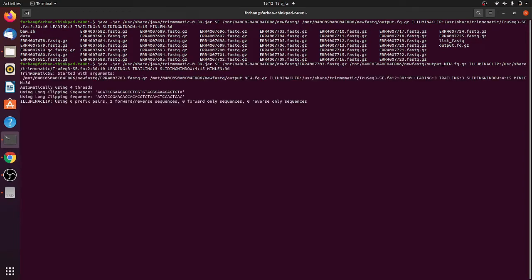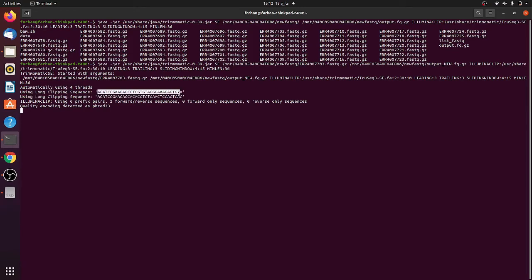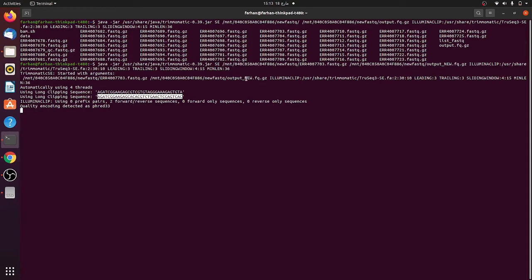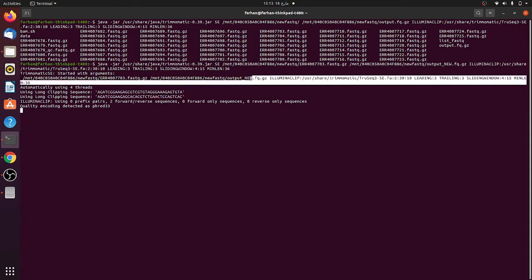Now here you can see the command has run, started to run here. The file, these are the arguments which we have passed and automatically it is using 4 threads. These are the two adapter clipping sequences which it will check in the file. After checking the file, these are two clip sequences.